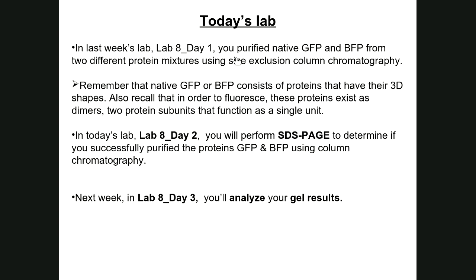So as I said before, in Lab 8 Day 1, you would have been given two impure samples containing either GFP or BFP. And your job would have been to purify those proteins, or isolate those fluorescent proteins, from a mixture of impure proteins using a technique called size exclusion column chromatography.